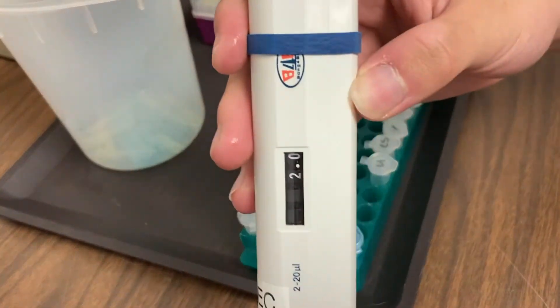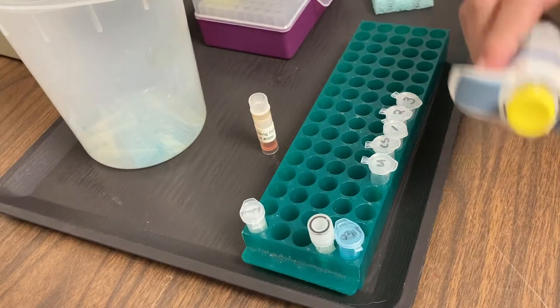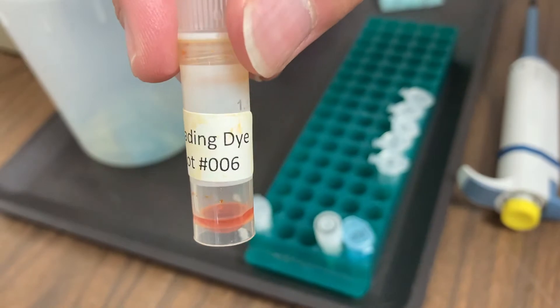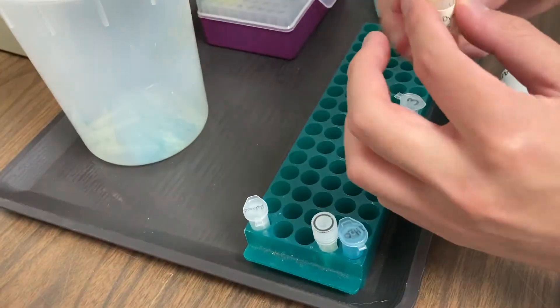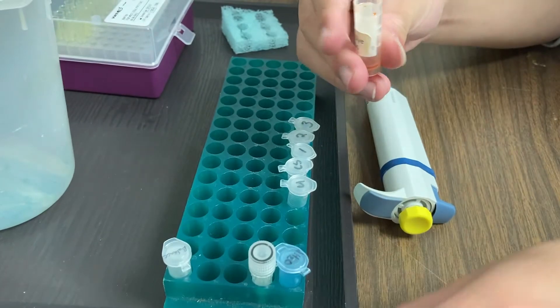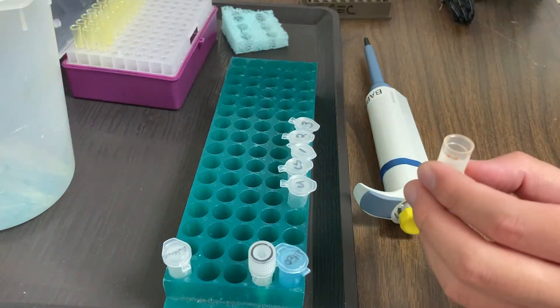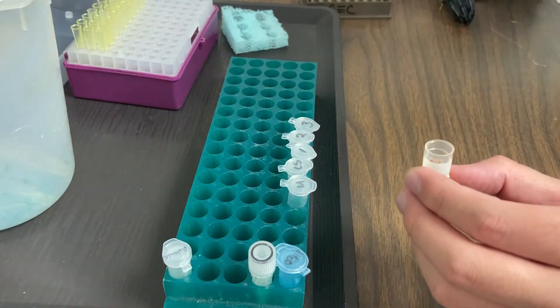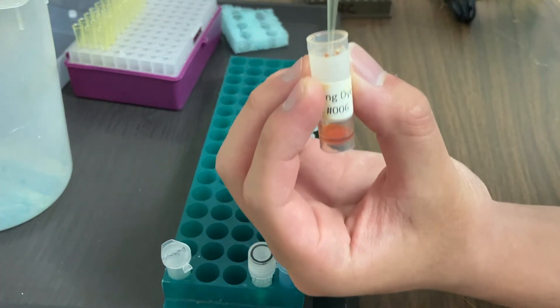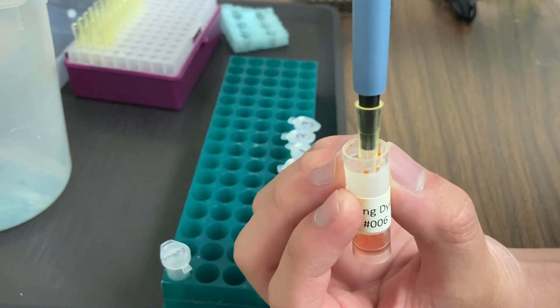We're going to set our micropipette to two microliters, and we're going to add something called loading dye. What the loading dye does is it mixes with the DNA, and it's very dense, and so when we add it to our agarose gel or the buffer above the gel, the DNA will then fall to the bottom. So let's go ahead and add our loading dye.